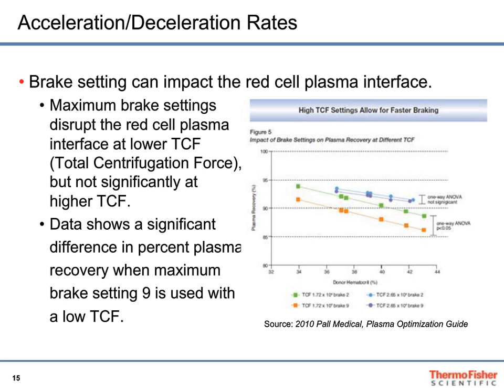And so one of the things that we talk to a lot of our customers about is, first of all, are they in a situation where they need to be careful about their accels and decels, and we can help with that. And then the second part is, okay, but let's do some work. And you see a chart here. This is just out of some work that was done some years ago, and not meant to be read here, but you kind of see that there's some data taken here, and that's the idea.